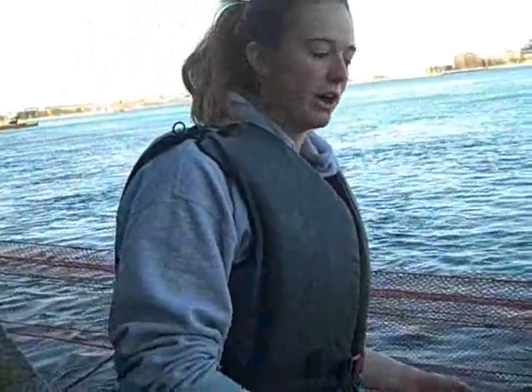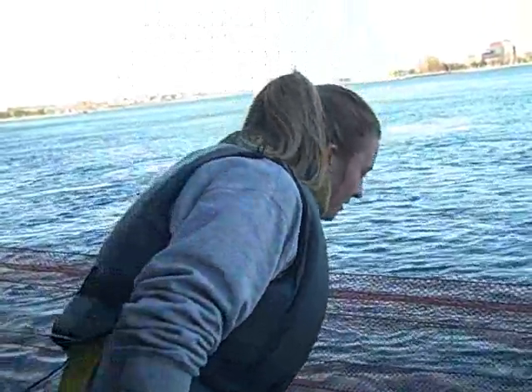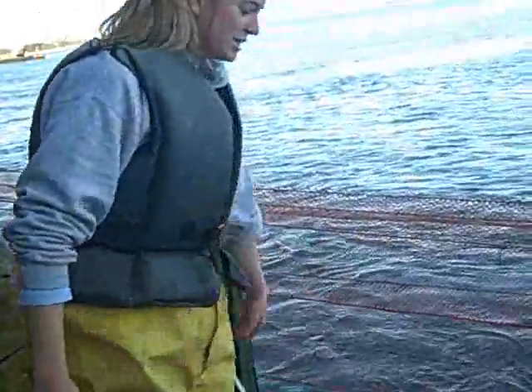We set the net down and then as soon as we see a fish get caught in the net, we haul it up and take it out so that way it doesn't die, because we obviously want them alive so we can get their gametes. And then we just sit and wait.